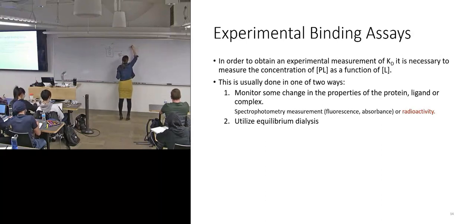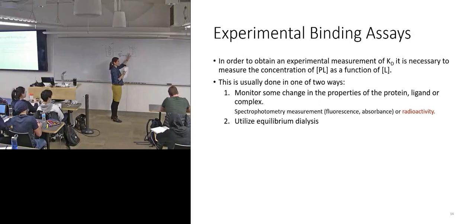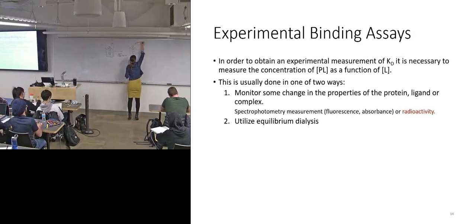And so now I'm going to have a situation where my proteins are bound to their ligand. Also, the concentration of free ligand inside is going to match the concentration of free ligand outside. Whatever's unbound in and out is going to want to be the same given enough time. We already talked about chemical potential difference or concentration differences. So there's both the bound stuff and the free stuff. Inside our dialysis tubing then, we have the concentration of the complex, plus we have some free ligand.